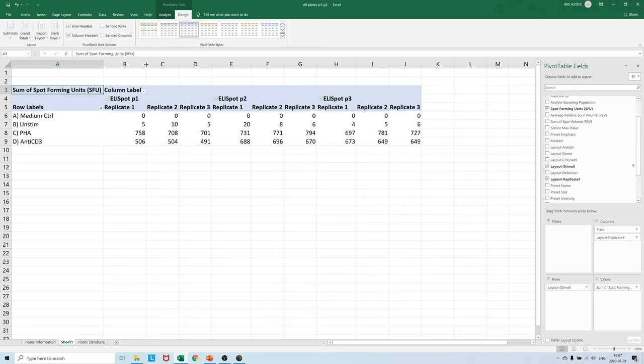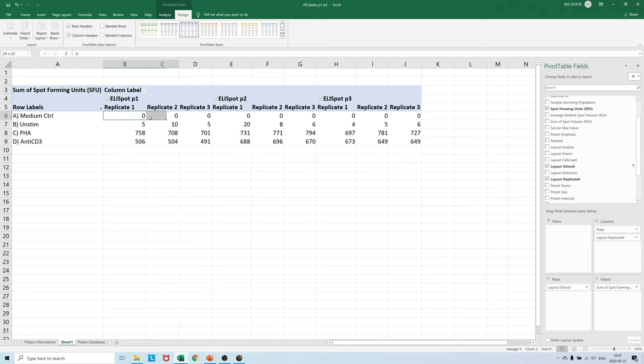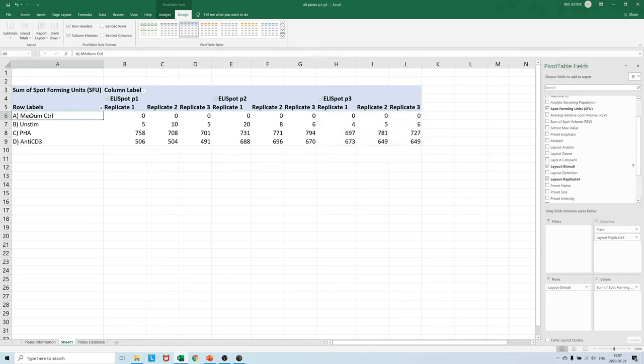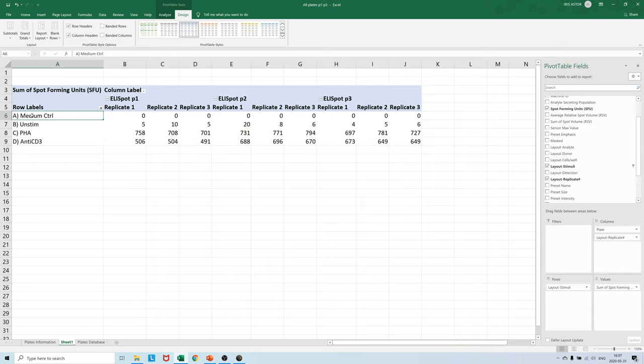And without the replicate numbers added Excel cannot understand how we want our data to be shown for plate P1, P2, and P3. You can process a massive number of plates this way. In fact, why not design your whole project around properly labeled templates combined with Excel exports as shown here. For a study with 50 plates you can easily save days of work in data processing.